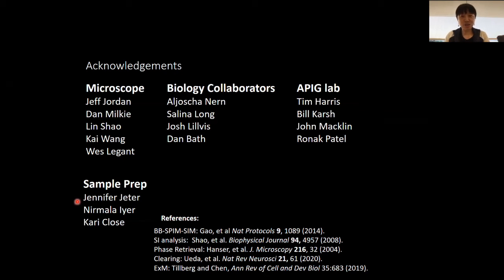I believe many of our audience are not from an optics background. If people want to use the structured illumination method in their lab, how can people start? Well, it depends on what kind of microscopy you're doing. There are commercial versions of structured illumination, I think both from Zeiss and from Nikon. I am pretty ignorant about how they actually work, because like most people who build microscopes, I only run my own, or almost. But there are commercial versions of it, and that's the place to start if you're doing wide field microscopy.